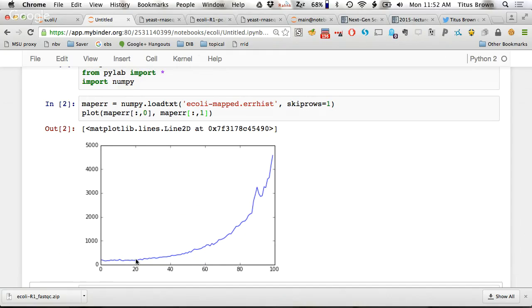That's an example of a systematic bias as opposed to a random error, right? To explain that a little bit more, generally in sequencing, all of the tools assume that you're doing a fairly random sampling, and any systematic error, systematic bias is going to give you non-random results in your downstream pipeline. So you sort of want to get rid of them. I don't have a script to do that, but if you come to data therapy, we can help you if you run into this problem. I'm not going to show you this for the RNA-seq, although you can also calculate this for the RNA-seq. RNA-seq is where you actually will see some pretty big nasty biases.